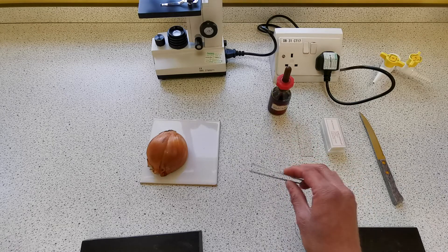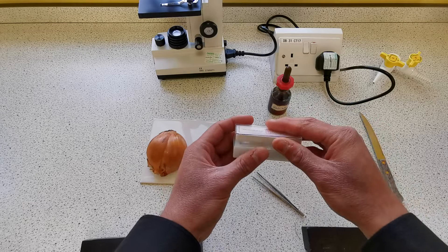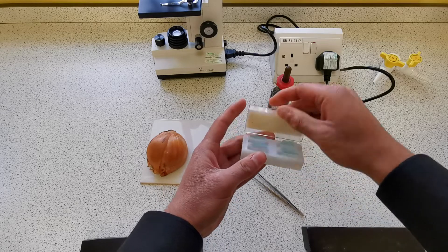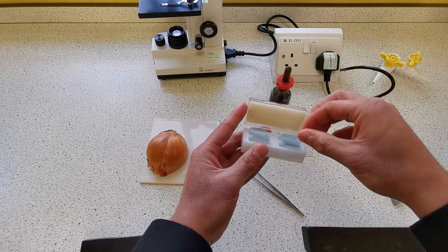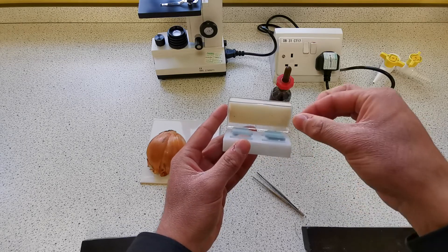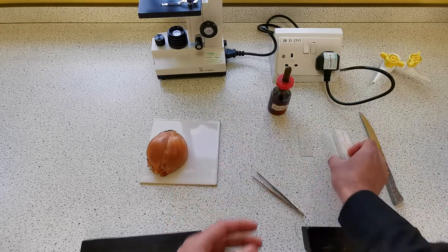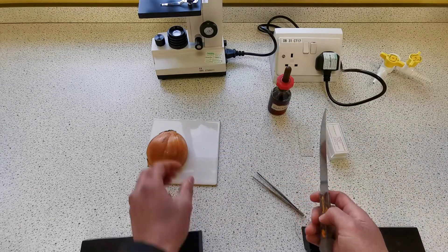We've got some forceps, a slide, and these are cover slips. These are very small pieces of glass that we put on top of the sample on the slide, so we sandwich it in with glass. And we've got a knife to cut the sample.